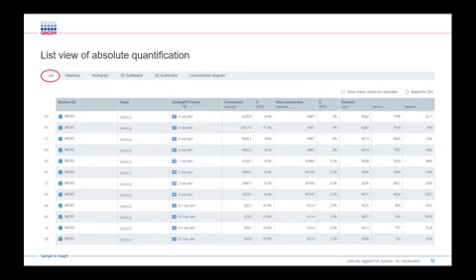The sample/NTC/control designation. This column shows the sample, NTC and control name with its corresponding icon that identifies the sample or indicates whether the entry is a negative control, no template control, or other type of control. The concentration is given in copies per microliter. This column shows the concentration assigned to each target or channel per well. If we had identified various targets within one and the same well, because we performed a multiplex experiment, those would all be listed in addition.